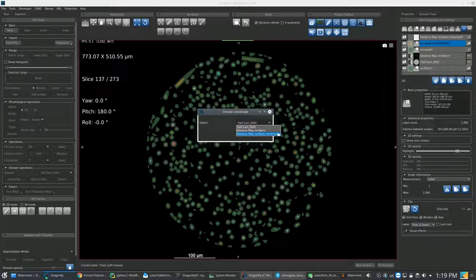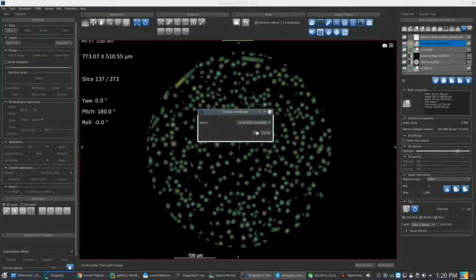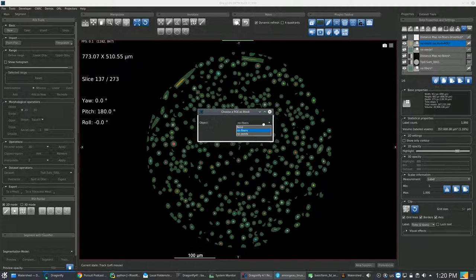Then in the Choose Landscape dialog box, pick the Distance Map ROI Fiber. In the Choose as Mask dialog box, choose ROI Fibers.